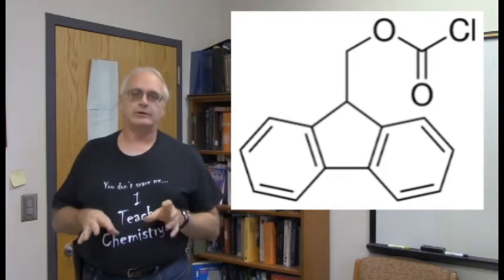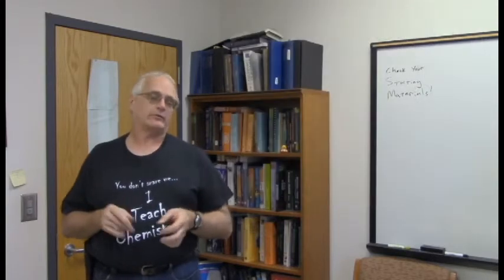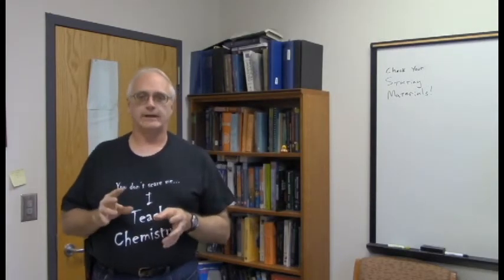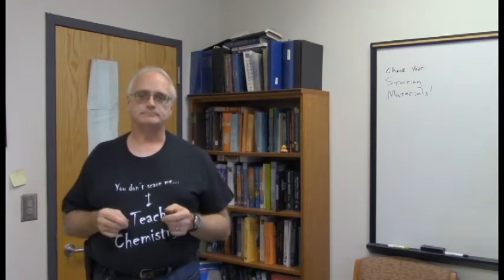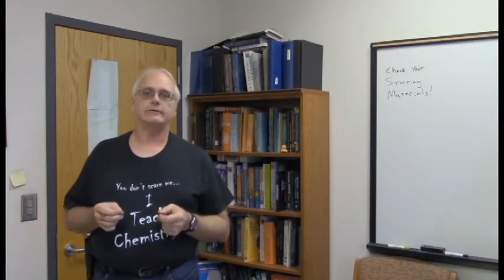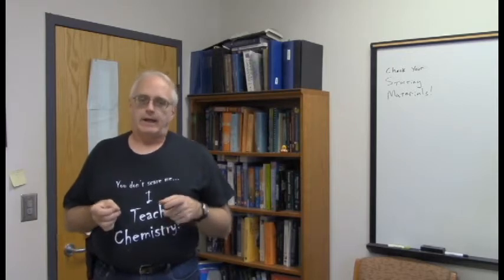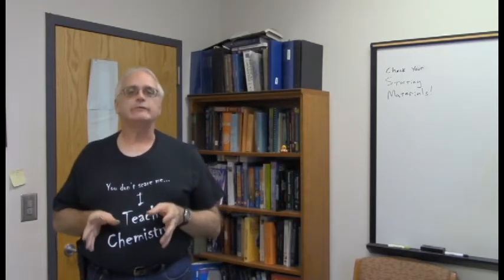And so, being good chemists, she and her research group wanted to get some NMR spectra of their starting material, check their starting materials before they proceeded. And I was happy to help them with it. We dissolved about 10 milligrams of FMOC in an NMR tube. It dissolved really nicely in deuterated acetonitrile. And so, having the sample, it was off to the instrument.